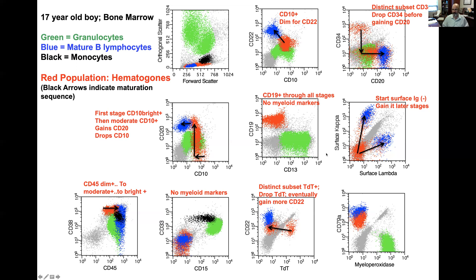CD45 goes from dim to moderate to bright. Similar to the CD34 phenomenon, TDT shows a distinct subset of TDT-positive cells, and then they drop TDT — two distinct subsets, TDT-positive and TDT-negative, not a big smear or all TDT-positive. The CD45-dim stage is loosely equivalent to the CD34-positive stage, which is also loosely equivalent to the TDT-positive stage, and which is loosely equivalent to the CD10-brighter population. So this cluster is the CD45-dim, TDT-positive, and CD34-positive one — trying to put this into six dimensions.